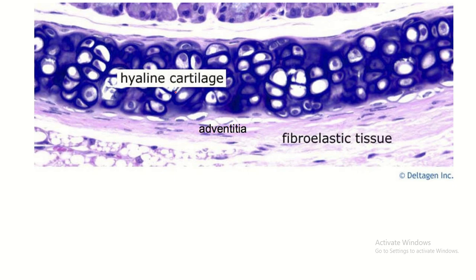This is hyaline cartilage — the background is bluish and glassy, homogeneous with no irregularity. The small depressed areas within the cartilage are lacunae, where chondrocytes are present. The surrounding collagenous connective tissue is the adventitia — this term is frequently used in histology and refers to collagenous connective tissue.